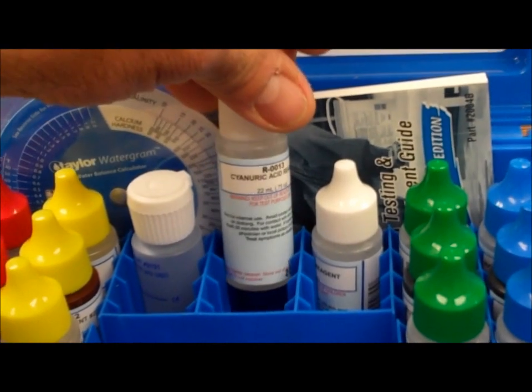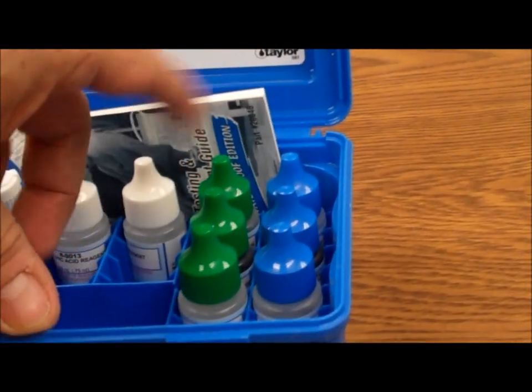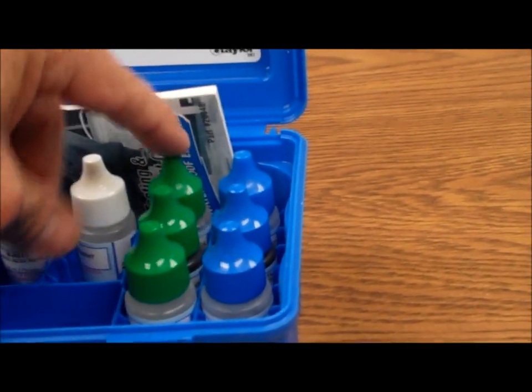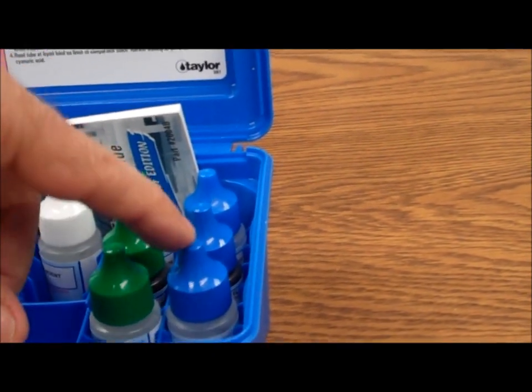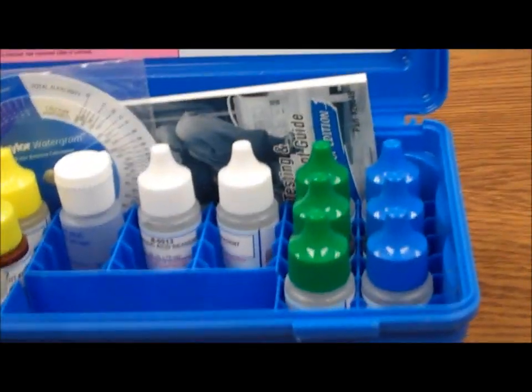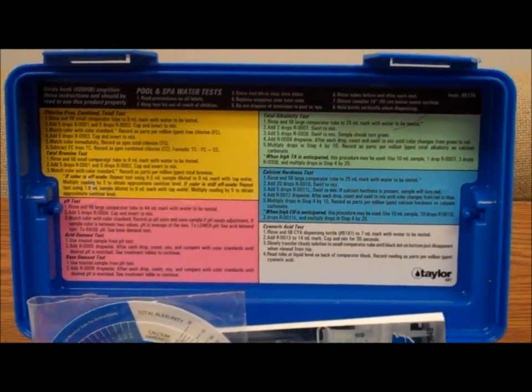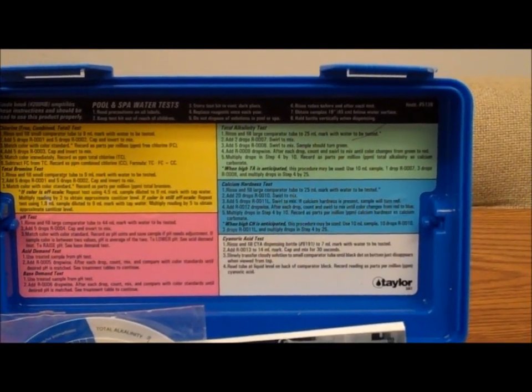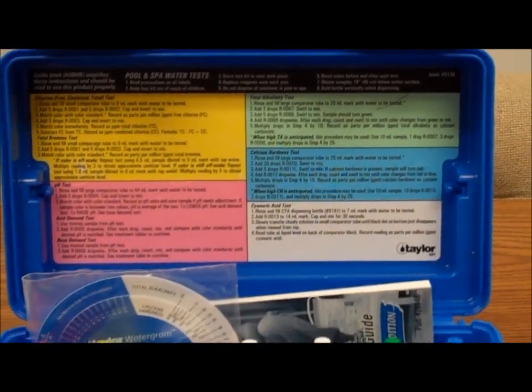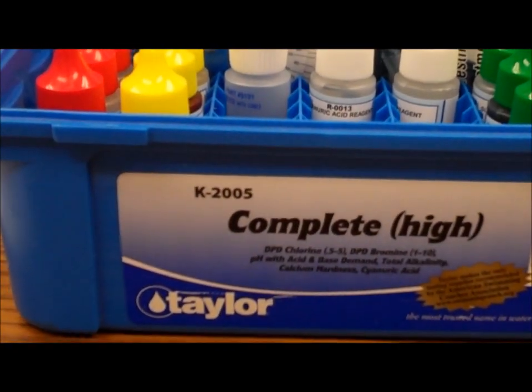There are two bottles of number thirteen cyanuric acid reagent. Then we have alkalinity — numbers seven, eight, and nine — and finally calcium hardness — numbers ten, eleven, and twelve. The directions are on the lid: chlorine is yellow, pink is pH, then alkalinity, calcium, and cyanuric acid.